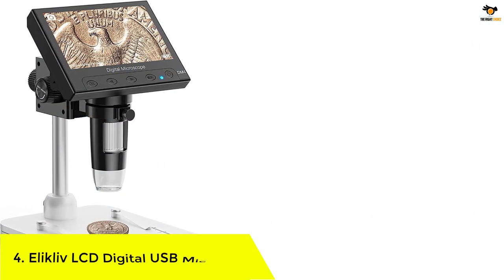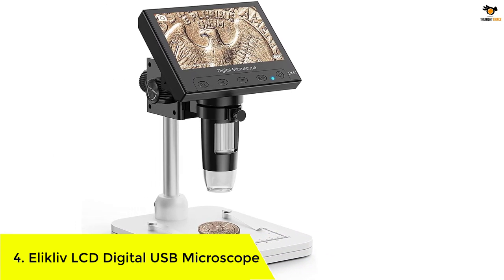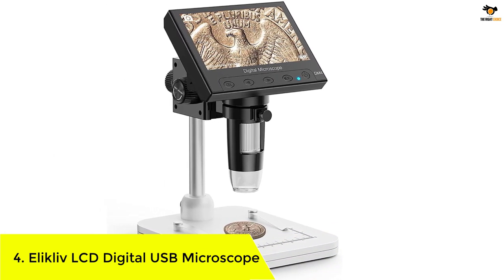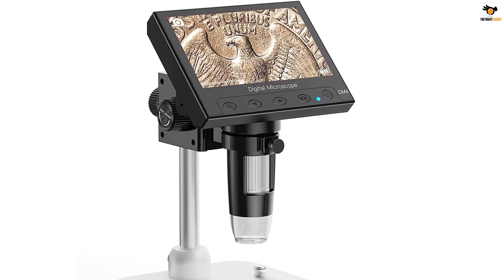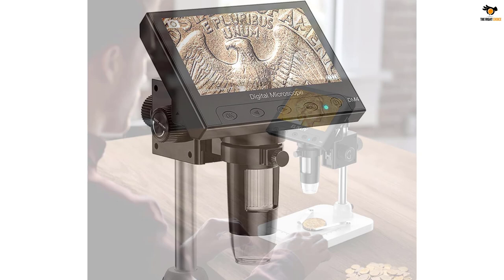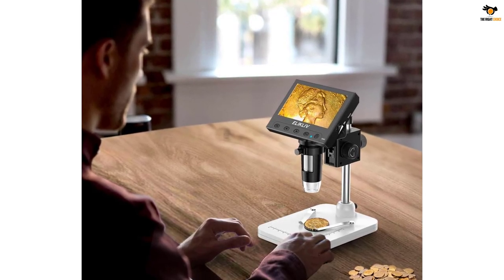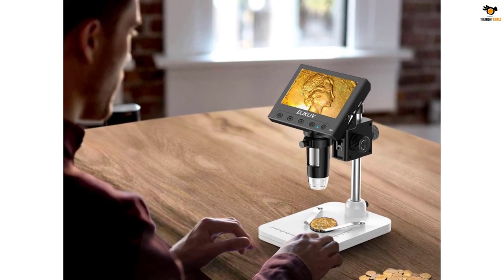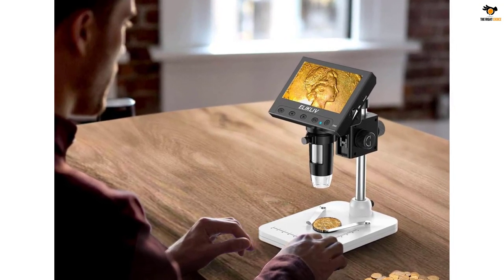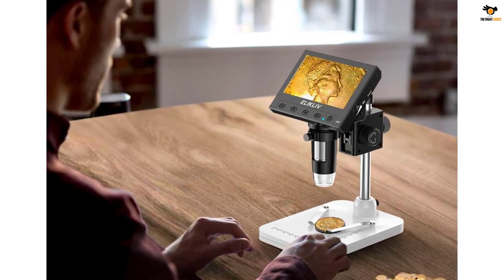Number 4: Elikliv LCD Digital USB Microscope. If you are on a budget and want something affordable, you should check out Elikliv and its digital USB microscope offerings, since they are quite cheap but still offer various features. Elikliv's digital USB microscope is the cheapest option mentioned here. Because of its low price tag, it is a great option for buyers on a budget.